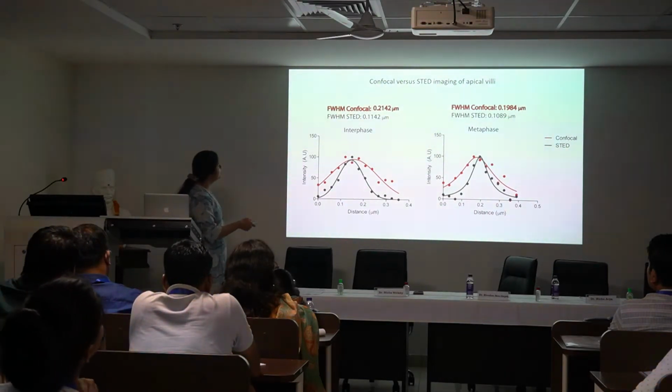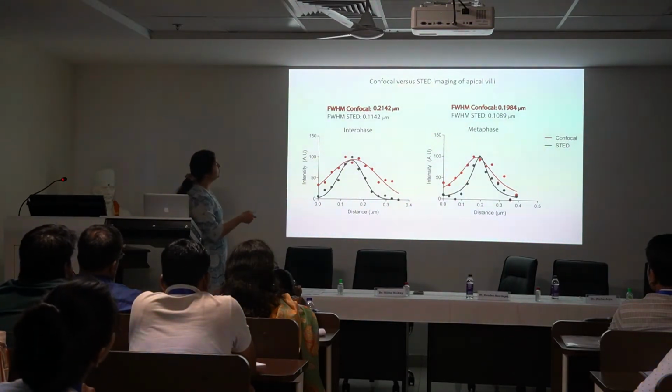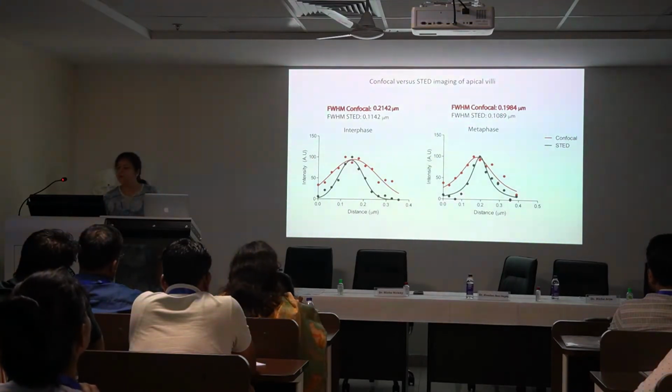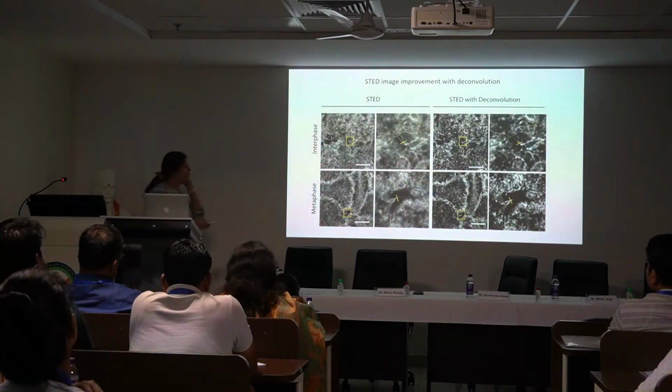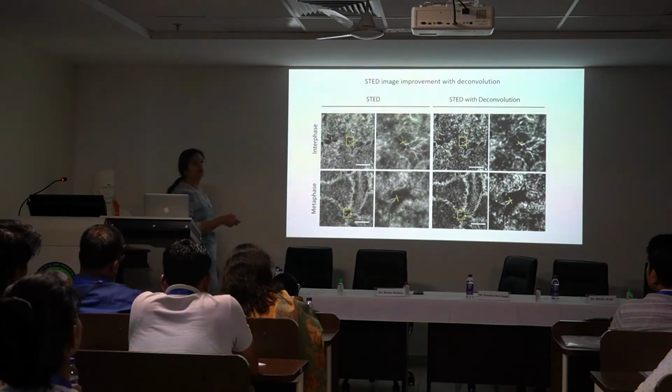So you can see that the spread is smaller for the STED as compared to the confocal microscope, right? And this is both in the case of interphase as well as in the case of metaphase. Now, one more thing on top of this which is done in that microscope is that one can put a deconvolution algorithm on top of this, and hopefully Ashish will explain to you more about this at the microscope.